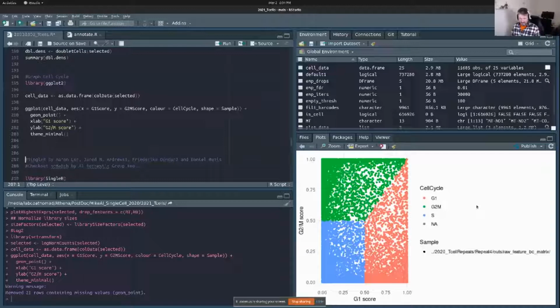Some people regress out cell cycle in their analysis. If you read any paper from say 2017, 2016, a lot of people regressed out the cell cycle because they were looking at differential gene expression. All those papers were differential gene expression. And they're like, oh, I don't want my cell cycle genes to be influencing my differential gene expression just because they're in a different state of cell cycle. That's not really the gold standard anymore. In fact, cell cycle genes are such a small component and will be so downplayed compared to the types of expression differences, the levels you actually will see in real events.